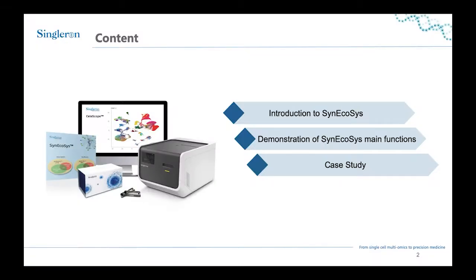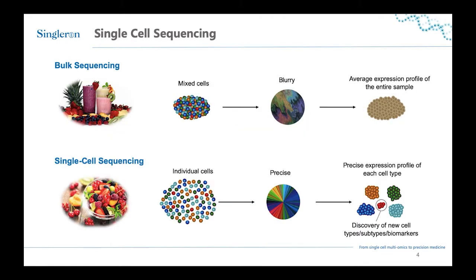I'll start by introducing you to this database, then I'll demonstrate its main functions, and finally I'll guide you to a case study to illustrate how it can be applied to research. But let's start with the importance of single-cell sequencing.